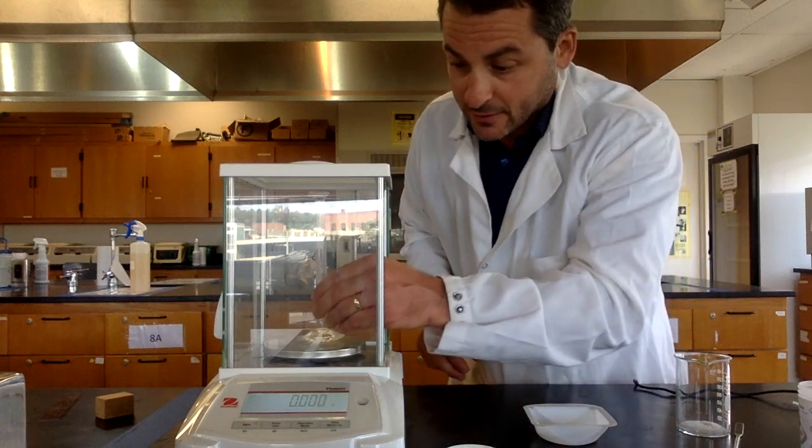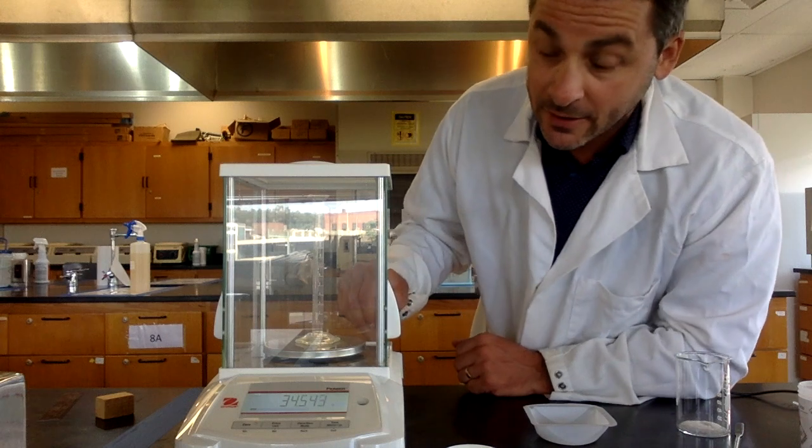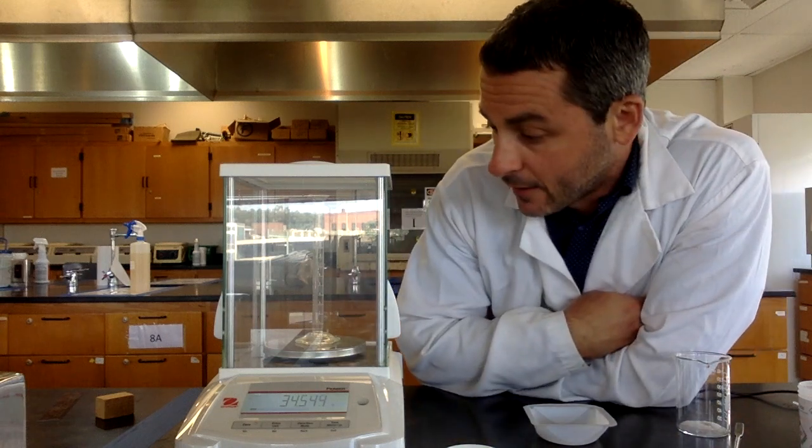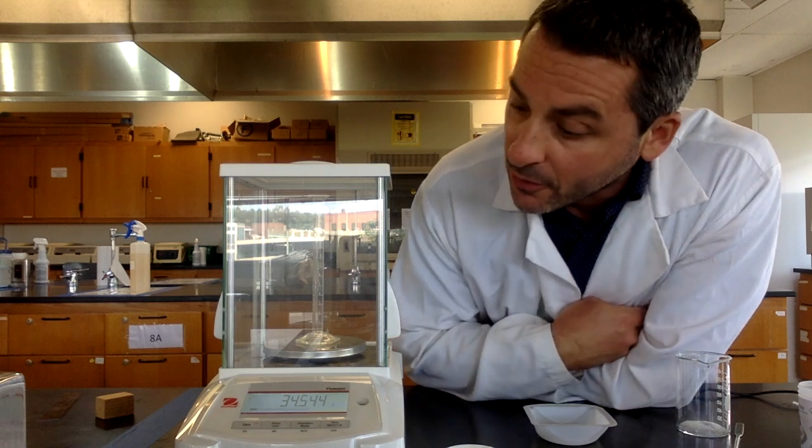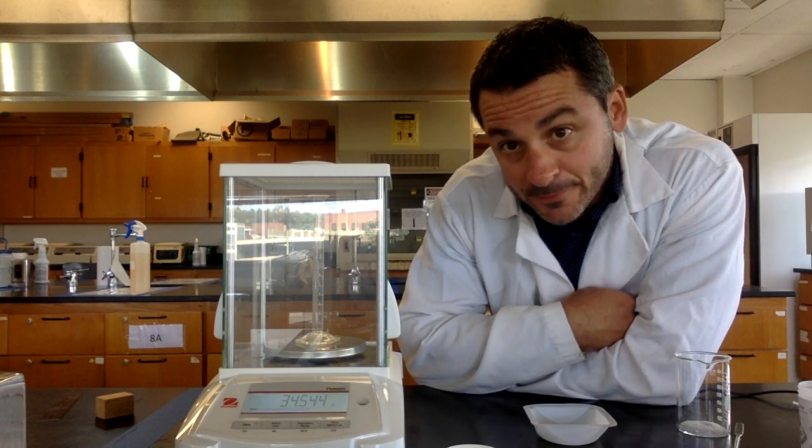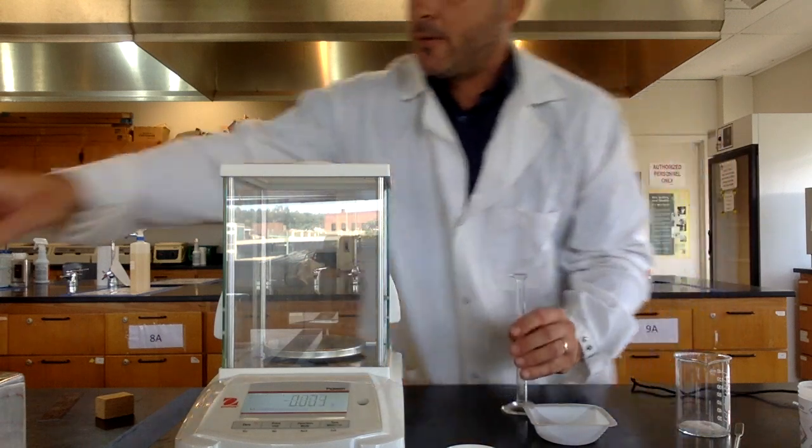You can also weigh liquids in the same exact fashion as we will do in the density lab. You're going to take a graduated cylinder and weigh it. Always make sure that the balance says zero before you put that on there. Now I record the mass, 34.544 grams.